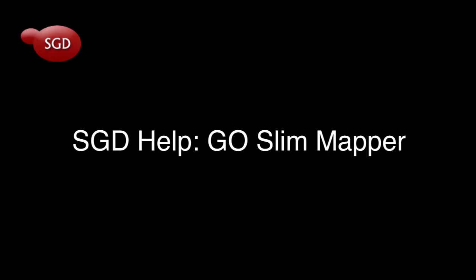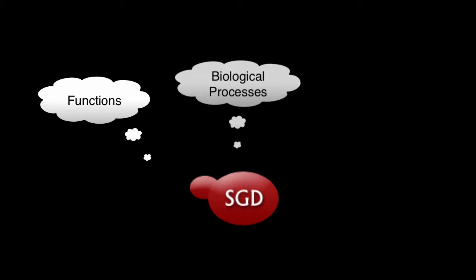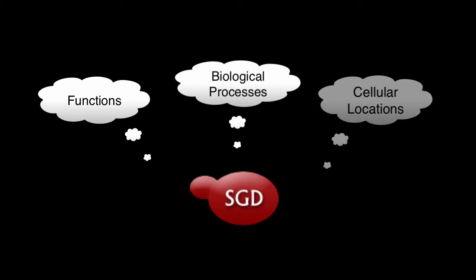Welcome to this quick video tutorial on SGD's GoSlim Mapper. Have you ever wanted to analyze sets of genes and identify their common functions, biological processes, or cellular locations? The GoSlim Mapper tool uses Gene Ontology or GO annotations to do just that.